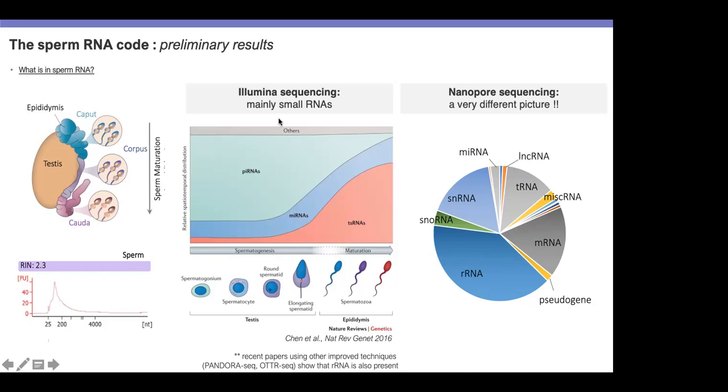You need flow cells like you would need for Illumina, and you use a new flow cell each time, right? The device is the same, whether you have a MinION, a GridION, or a PromethION. If you have any issue with the device, the company will replace it or fix it, whatever it is, right? Basically we have had some issues at some point, and then they replaced it with a new one.